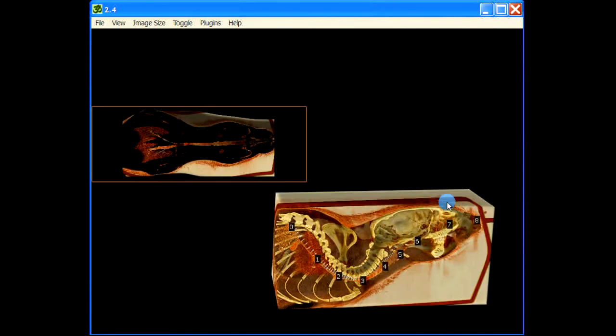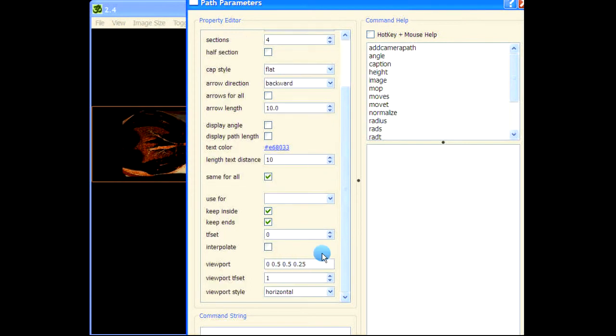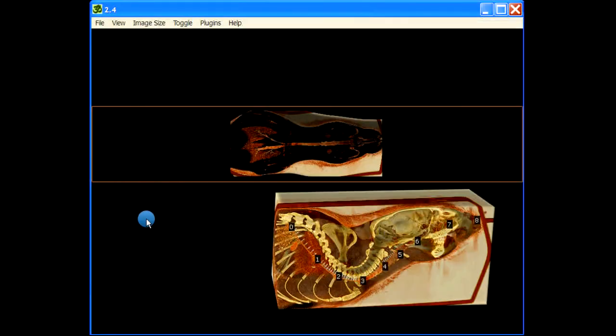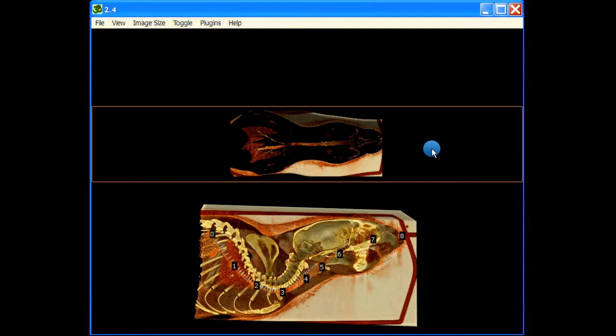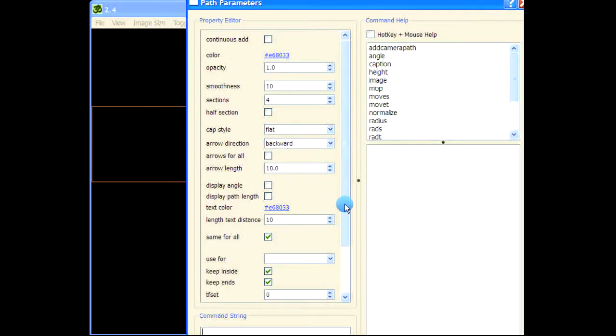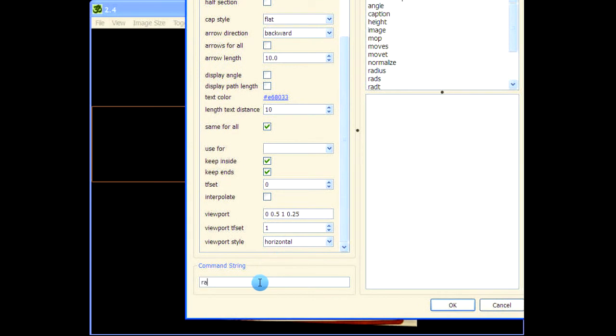And so on. So you can make use of the viewport. And then using shift and then mouse wheel to increase the size of the green axis, or you can press spacebar and then change the size of the green axis.